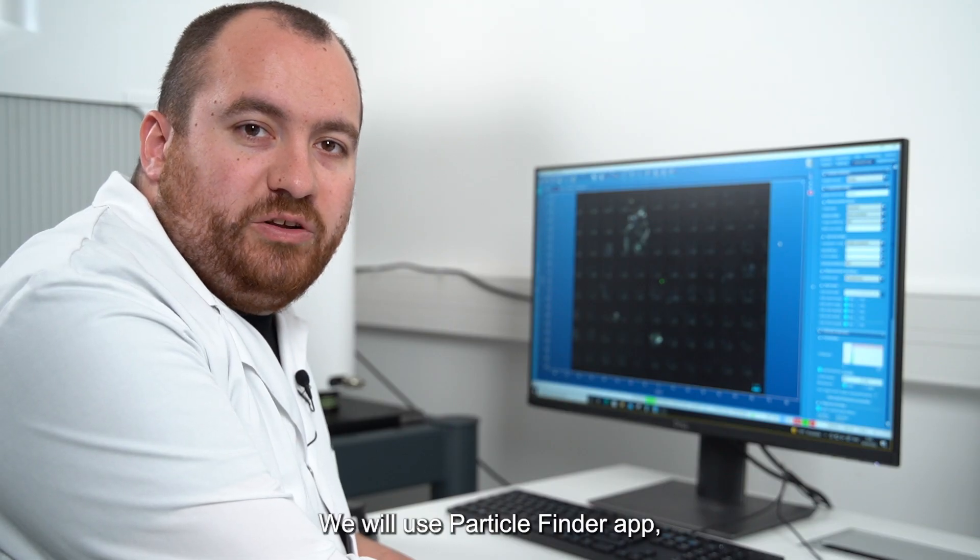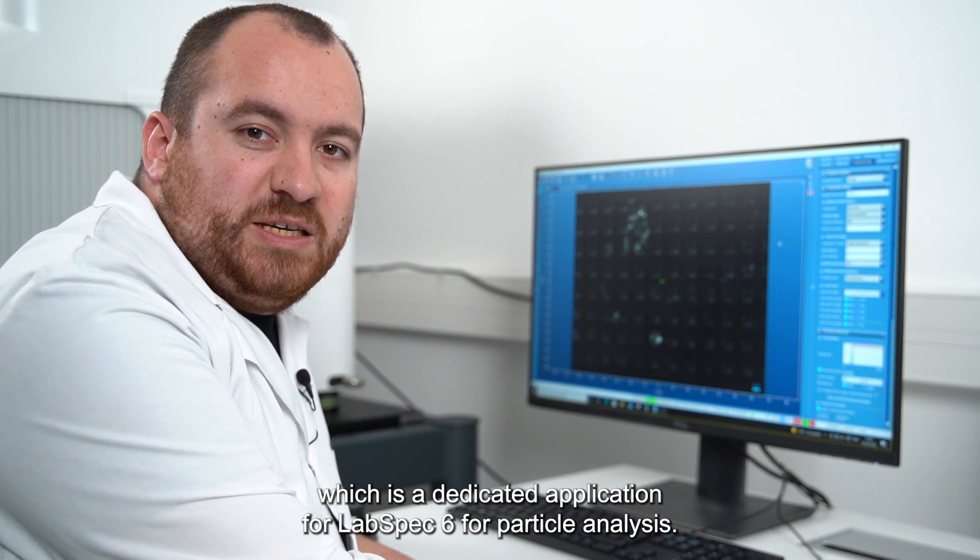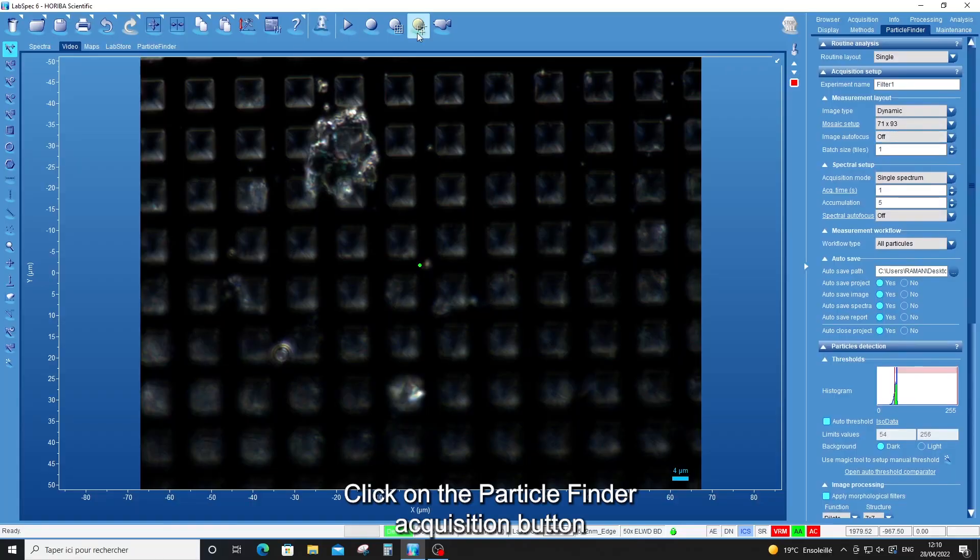We will use Particle Finder Hub, which is a dedicated application for LabSpec 6 for particle analysis. Click the Particle Finder acquisition button to start the acquisition.